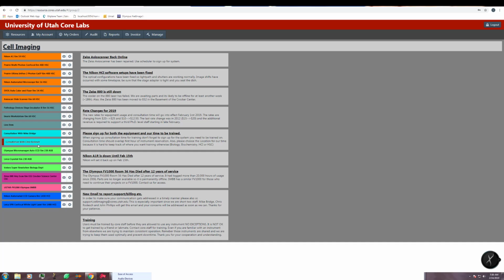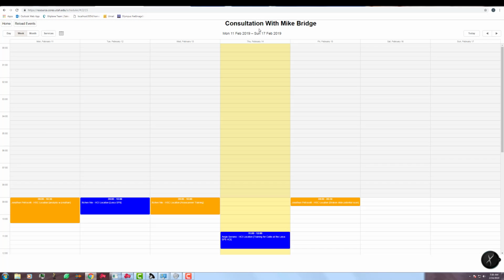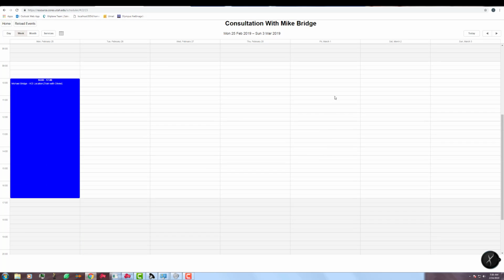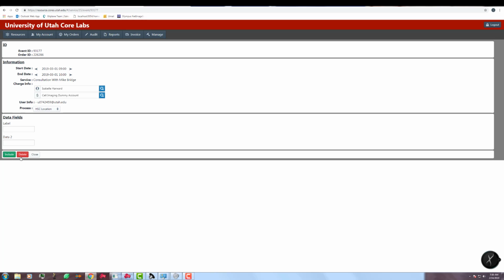I will click Michael Bridge, and I will choose Friday, March 1st for an hour of his time from 9 in the morning until 10. So this is my time from 9 to 10. This is me, and this is the account that is associated with my lab. And this labels where you can put what type of imaging you're doing so we can know what to expect so we can help you best. So after all that is done, we'll close it out.